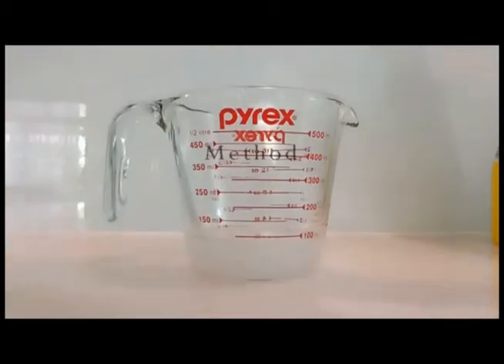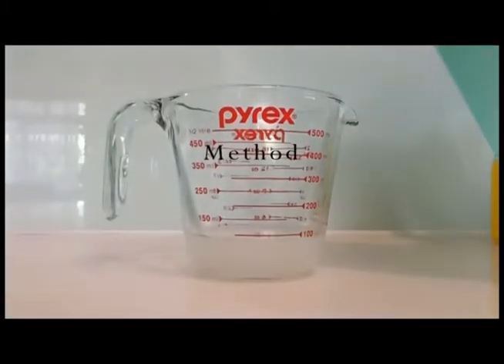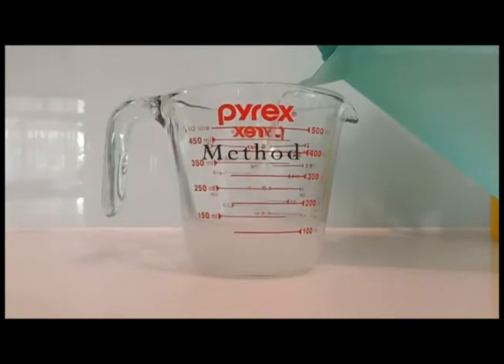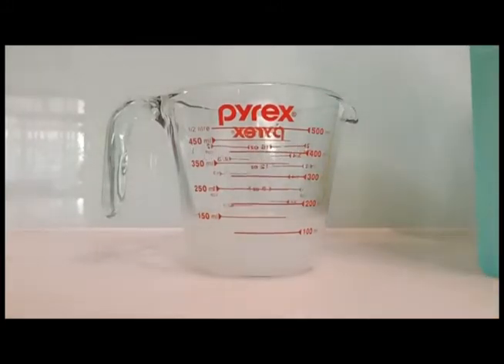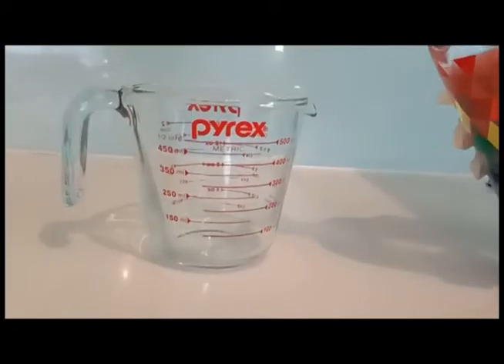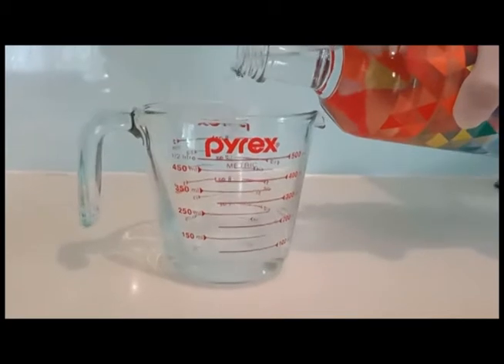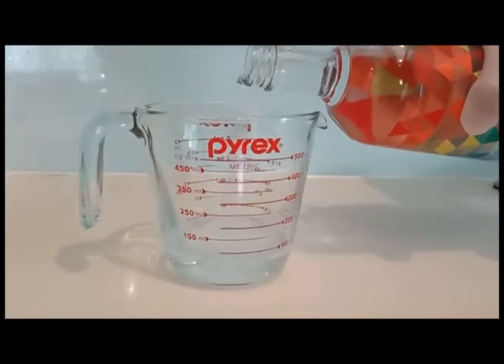Method: measure 150 ml of methylated spirits into a container. Measure 150 ml of 40% ethanol vodka into a container. Measure 150 ml of citric acid into a container. Measure 100 ml of citric acid into a container. Into this container, add 50 ml of water to create a dilution.